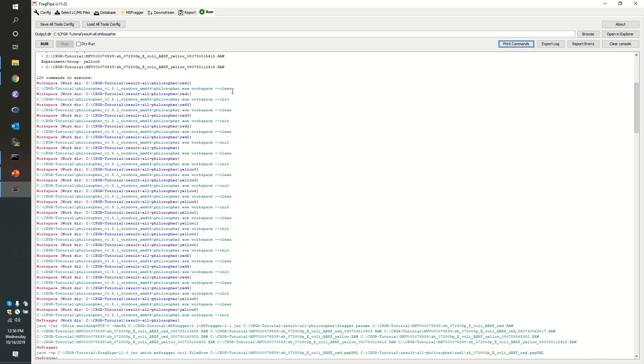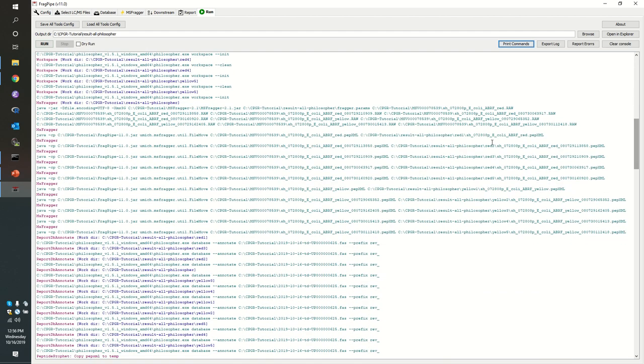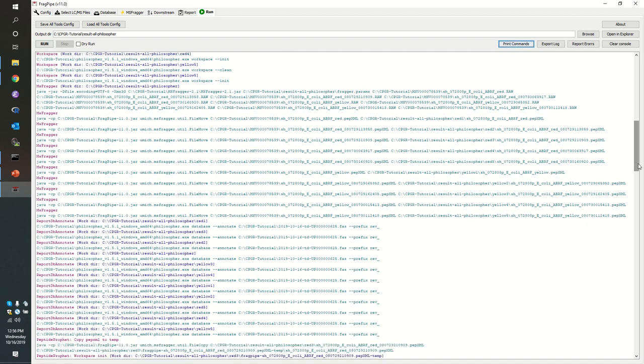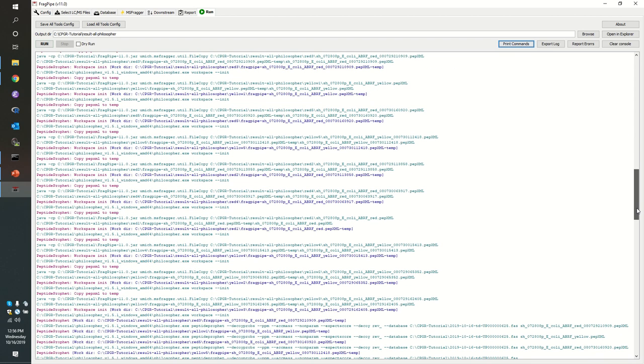We're going to create workspaces. You see it's going to clean them and then initialize new workspaces for each of the different raw files. It's going to launch msfragger on each of those input files, and then we have things like report database annotate. Down here we have peptide profit.